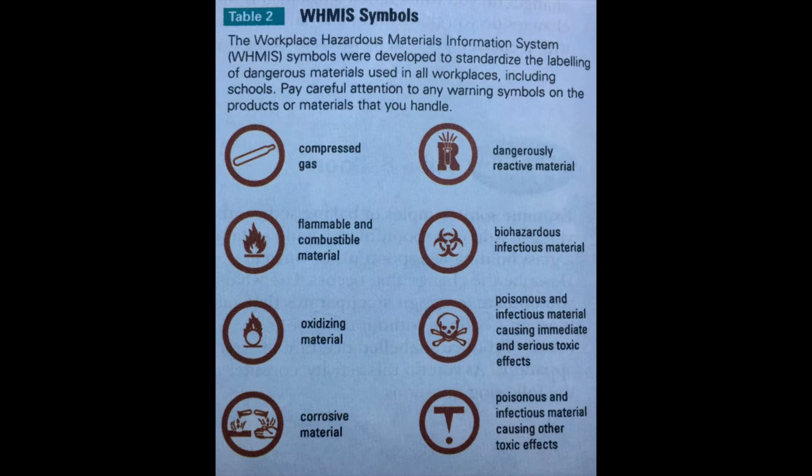Trust me when I tell you, there will be none of those chemicals in your laboratory, but they do exist. And if you are employed where a workspace has those chemical symbols, a great deal of respect should be shown to the container.